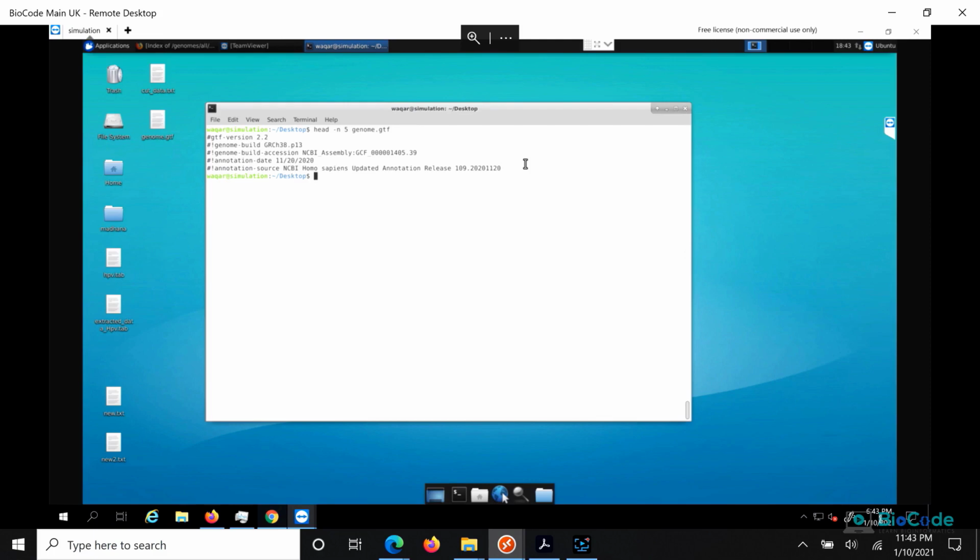Otherwise our various binary programs such as cut, sed, and other tools such as sorting tools will not work properly, because this will hinder the process. The other data in this file are column data, but this is a single line, so we have to remove this data.